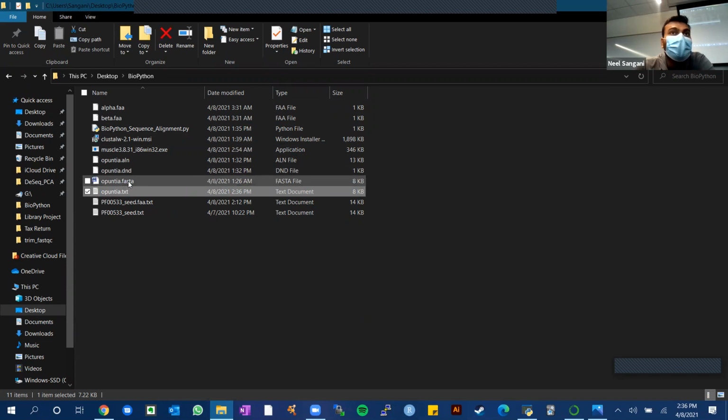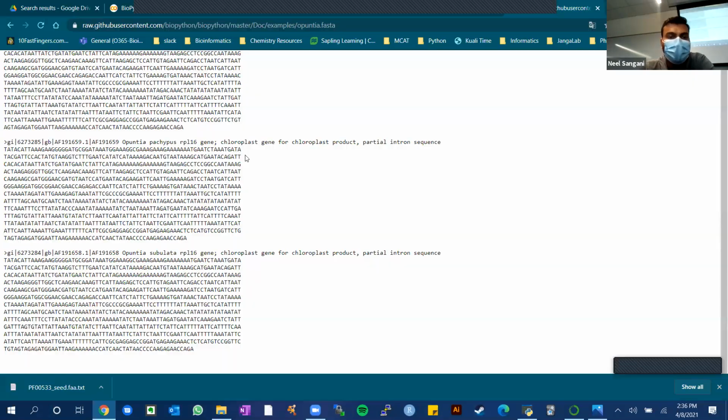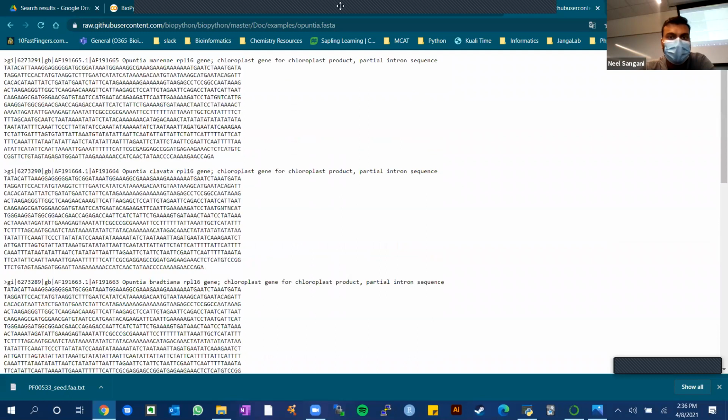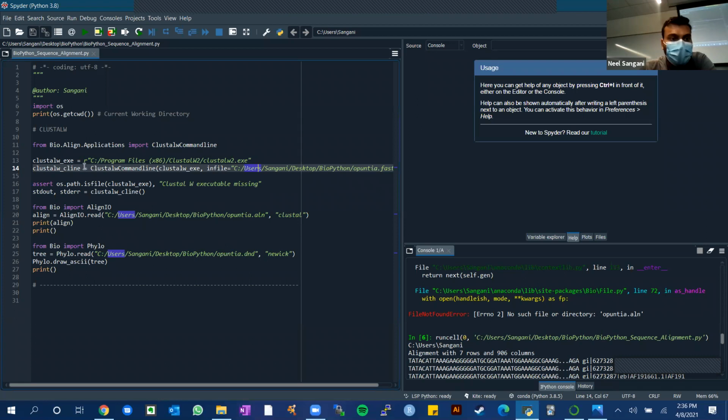It could be in FASTA format too, whichever one you want. Again, whichever file format you do. So just a quick note, the file format we see here is in FASTA format, right? So we're going to make sure that it's in FASTA format.